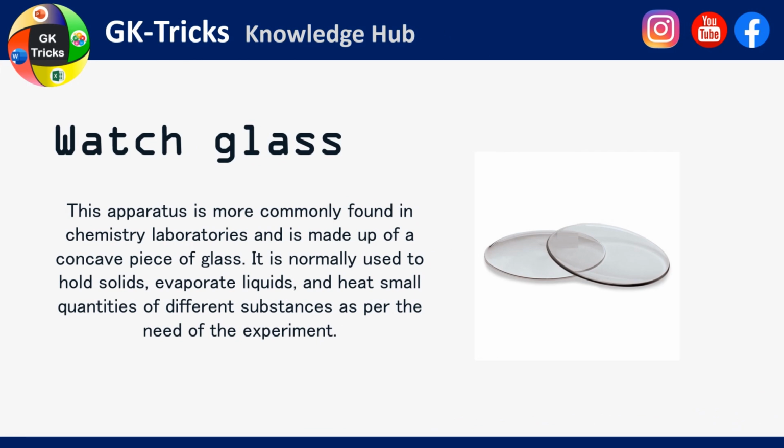Watch glass. This apparatus is more commonly found in chemistry laboratories and is made up of a concave piece of glass. It is normally used to hold solids, evaporate liquids, and heat small quantities of different substances as per the need of the experiment.